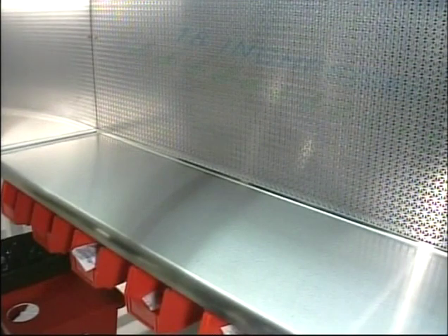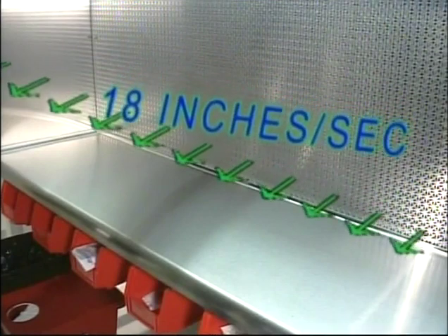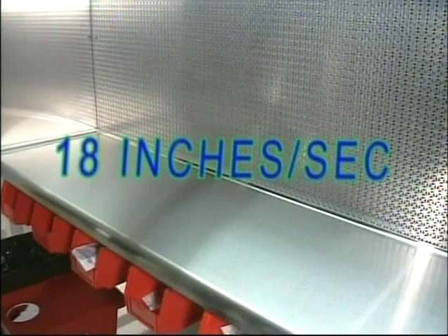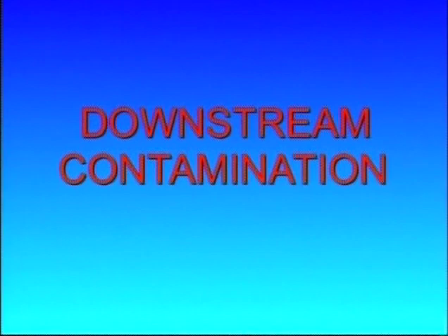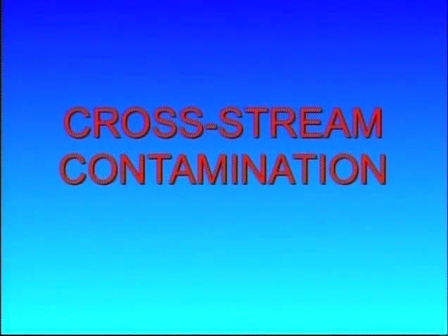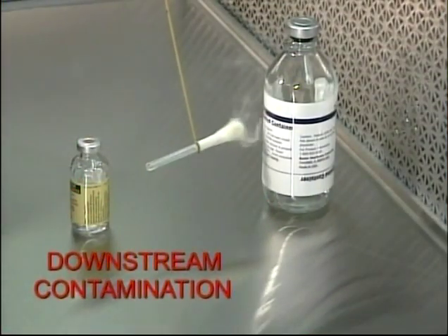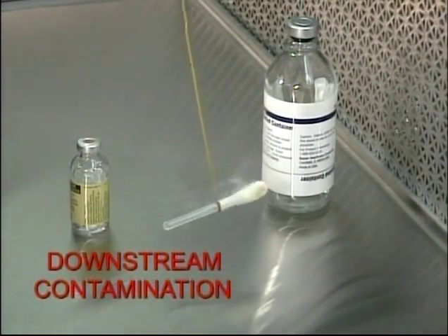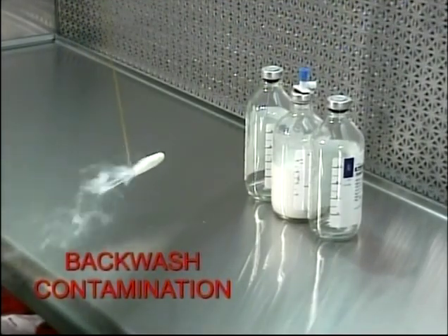Because the flow of first air in an LFCB is relatively slow and easily disrupted, there are several factors that may cause disruption of first air flow, leading to contamination. The three principal contamination models in an LFCB are downstream contamination, backwash contamination, and cross-stream contamination. Downstream contamination may occur whenever a critical site is placed downstream from another object, blocking the flow of first air from the HEPA filter. Backwash contamination may occur when room air is allowed to wash back into the LFCB.